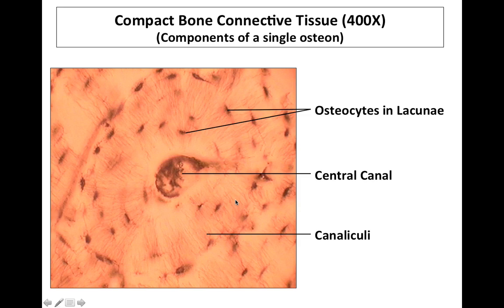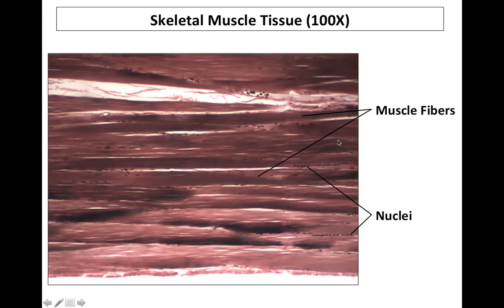And as you zoom into this image, you begin to see that the cells themselves run along the pattern formed by an individual lamella. These cells are very similar to cartilage cells in that they are found in pockets called lacunae, and the cells are named for bone. They are called osteocytes. Chondrocytes for cartilage, osteocytes for bone. Branching off of the lacunae are tiny web-like tubules that are called canaliculi. These are responsible for the communication of chemical signals and nutrients between the individual osteocytes.